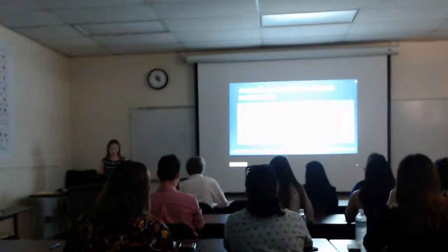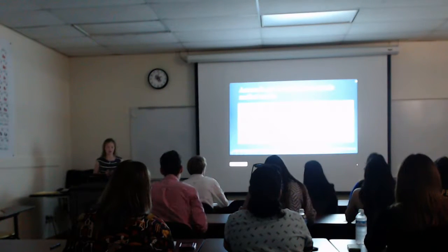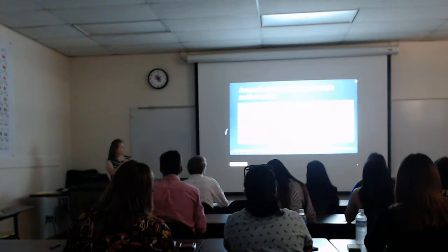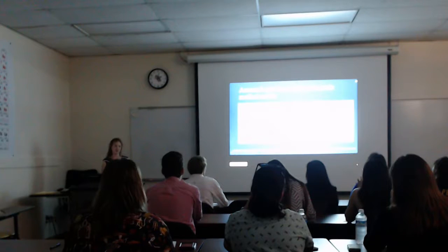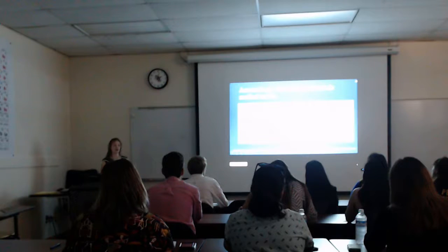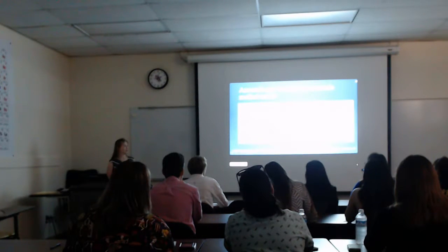So here are the results of that. This is the percent error of the method. This gives us the accuracy of the method associated with our accepted CEC from those standard clays we got from Purdue. Initially, this was done on the Wyoming clay, and I got approximately 50% error my very first time attempting this. We ran 5 samples of clay while doing this, so that each trial was made up of 5 samples. This allowed us to also have a standard deviation to determine how precise the method was.